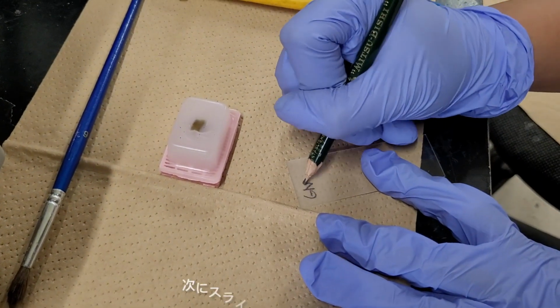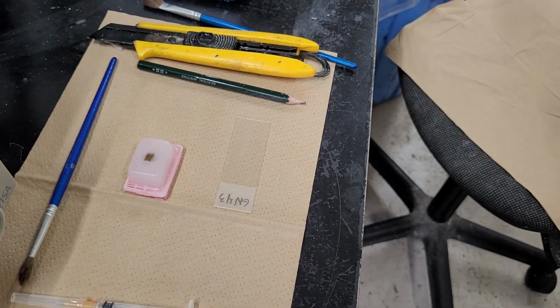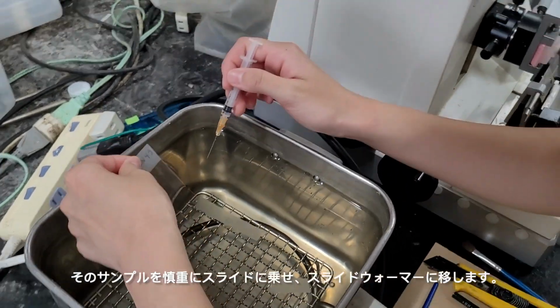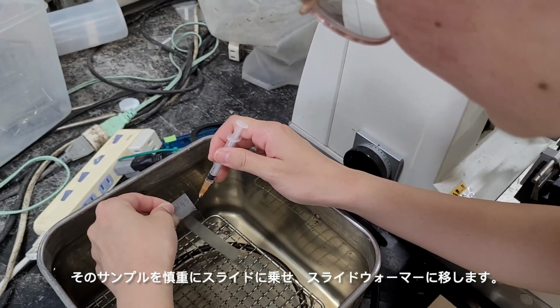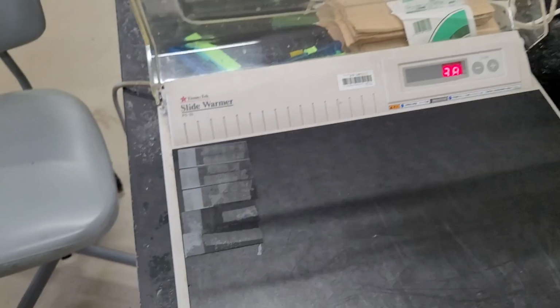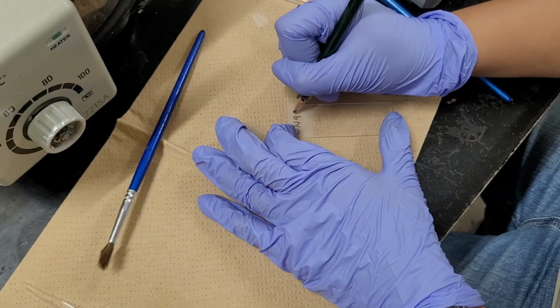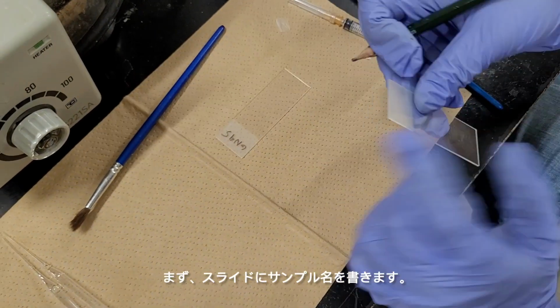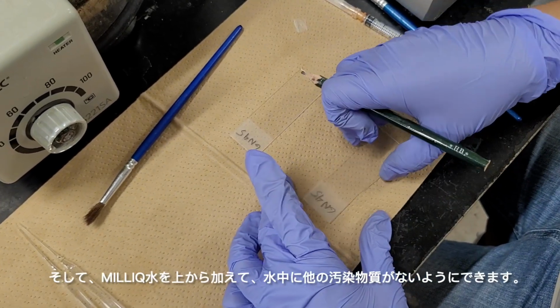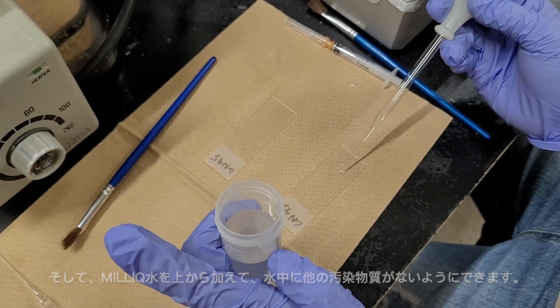Next, to mount your samples, you want to write down your sample name on the slide. And with a lot of finesse and delicate work, we will try and put that sample onto the slide before transferring it onto the slide warmer. Now there's also another way to do this whole microtome process, beginning with readying your slide, writing down the names, and adding milli-Q water on top, which can allow you to make sure that the water is free of any potential contaminants.